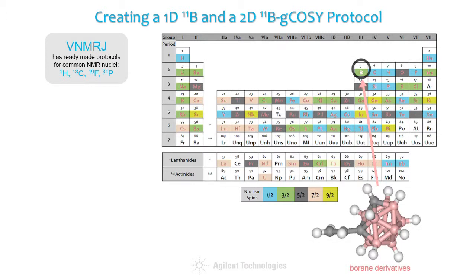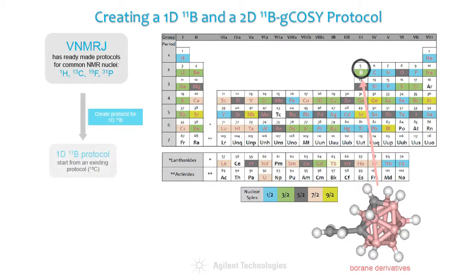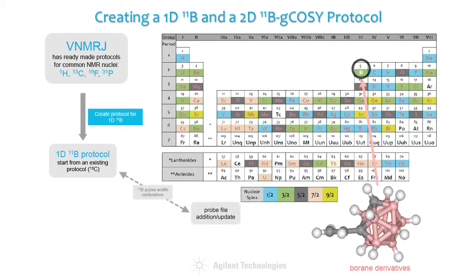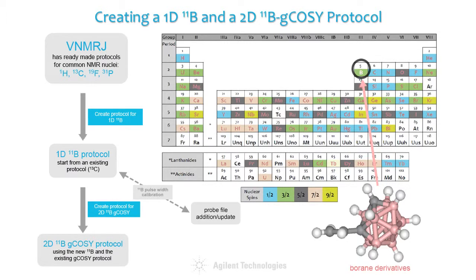In the current example, we consider a group of chemists dealing with molecules containing boron. They would like to record 1D boron survey spectra as well as a 2D boron COSY map to monitor boron-boron connectivities. We start with converting an existing carbon protocol to boron 11, do the necessary RF calibrations, and from there we create a 2D protocol allowing the chemists to set up boron-boron COSY experiments by clicking a single button in the experiment selector.